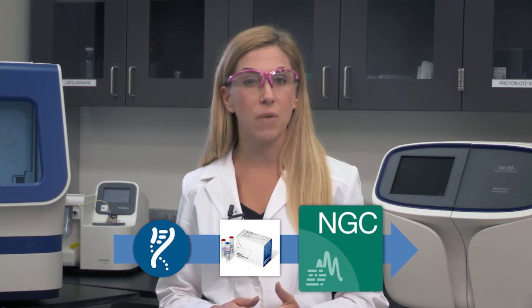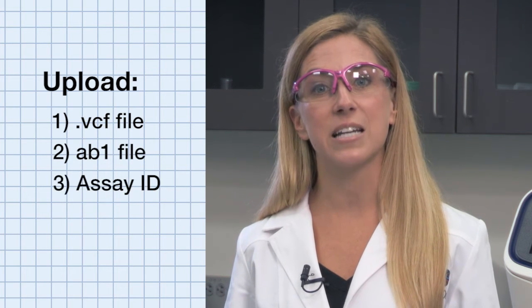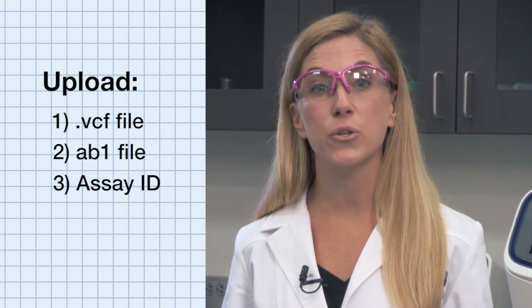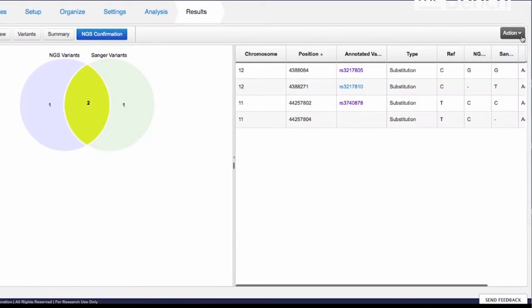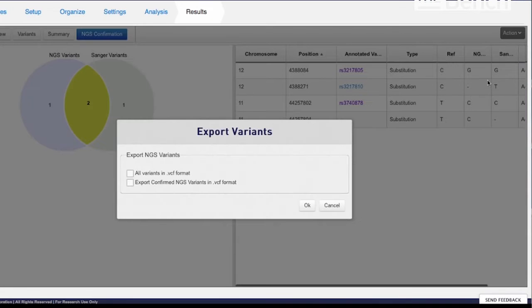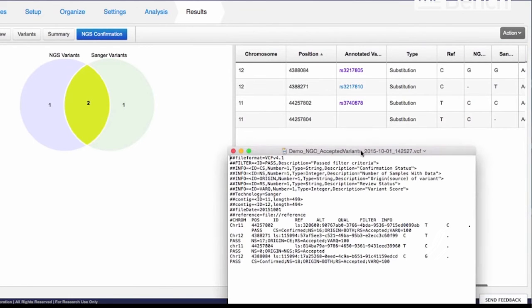Finally, we need to compare the Sanger Sequencing results with the NGS results. This can be easily done using the new Next Generation Sequencing Confirmation, or NGC, module on the Thermo Fisher cloud. Just upload your NGS .vcf file, your Sanger Sequencing traces, and the assay ID numbers for your PCR primers if you used the Primer Designer tool. A few clicks and you will get an alignment of NGS variant and Sanger Sequencing traces with the human genome, where you can visually verify the variants. You can also generate a comprehensive report or a joint NGS Sanger .vcf file for further downstream bioinformatics analysis.